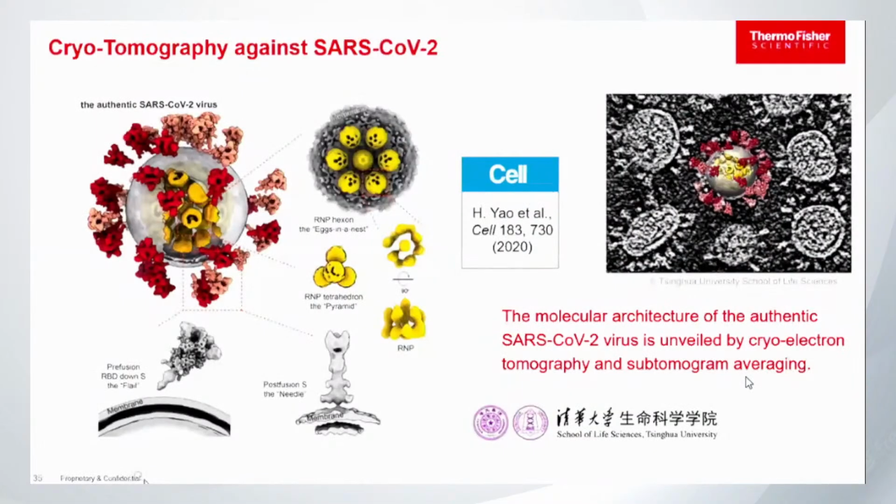So let me show you some examples of people already doing this very successfully. Of course, we are still in the middle of the pandemic. I think I will call it endemic already, because I think it's going to stay with us like the flu, probably. This beautiful guy here has been bothering us for 3 years. We were able, using tomography, to analyze the spike.